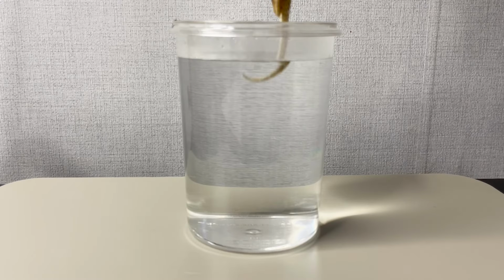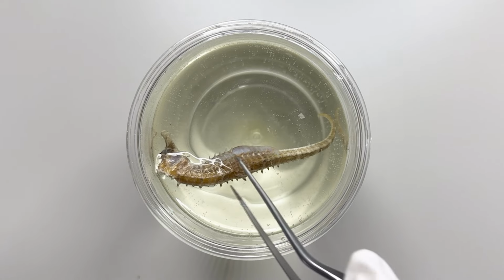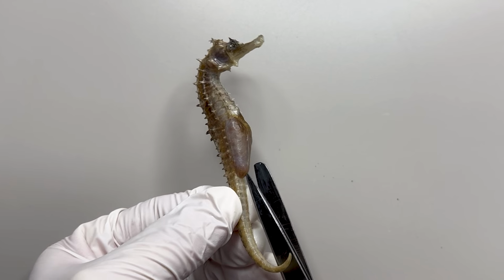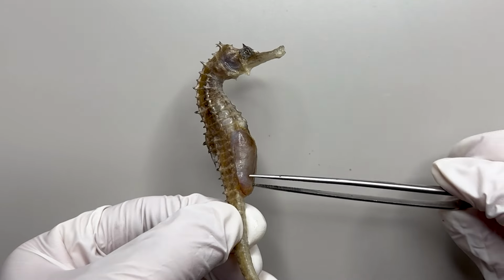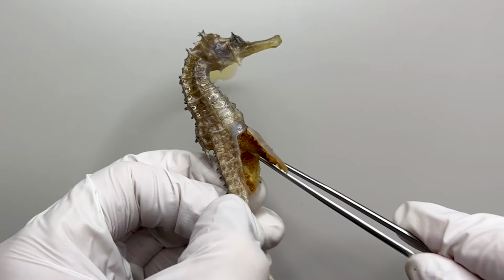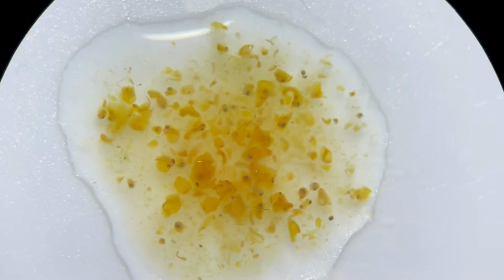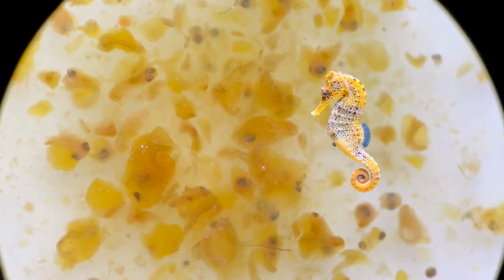To check this out, we softened dried seahorses in hot water, then took a closer look. It smelled like boiling dried fish. Next, I cut open the brood pouch. Inside, there was a lot of stuff. I took it out, mixed it with water, and looked under a microscope. To my surprise, these were all developing baby seahorses.